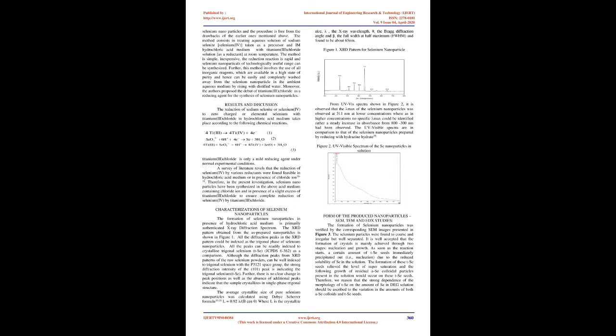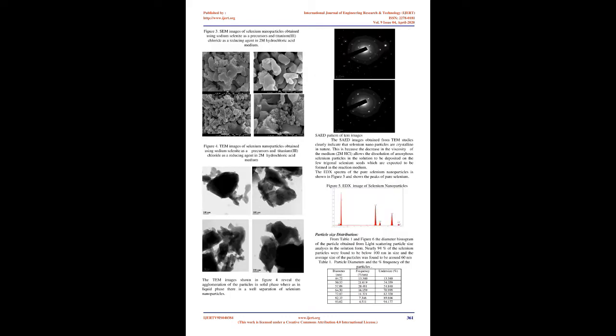Further, this method involves the use of all inorganic reagents, which are available in a high state of purity and hence can be easily and completely washed away from the selenium nanoparticles in the ambient aqueous medium by rinsing with distilled water. Moreover, the authors proposed the debut of titanium(III) chloride as a reducing agent for the synthesis of selenium nanoparticles.